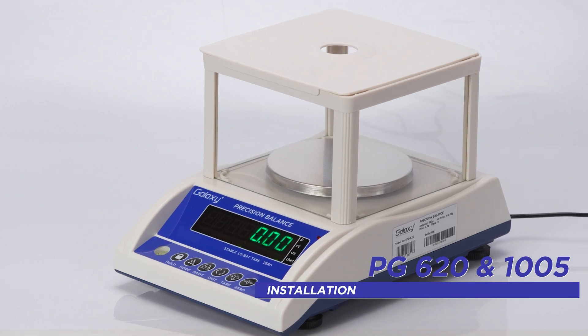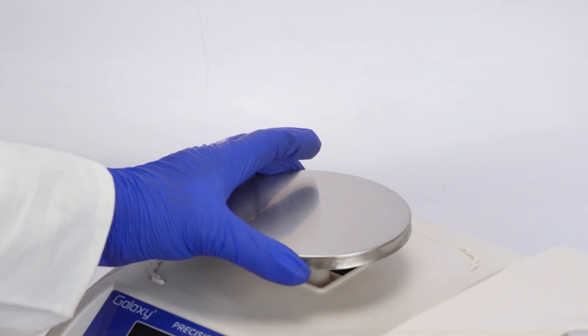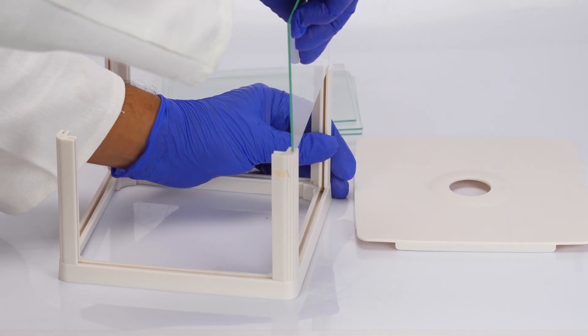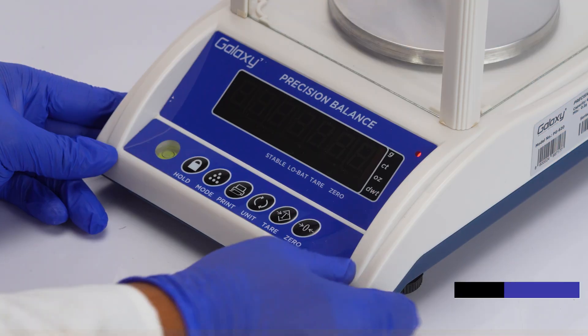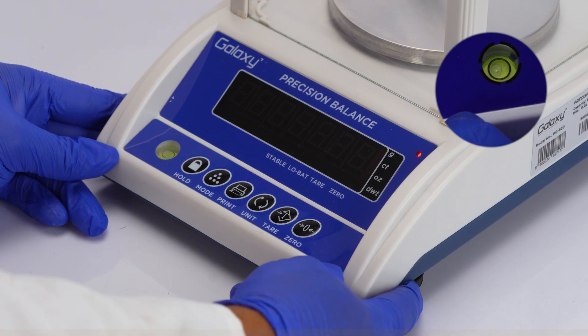Set the main unit on a flat stable surface. Securely attach the weighing pan and assemble the windshield. Check if the balance is level and adjust the feet so that the air bubble is centered inside the black ring.